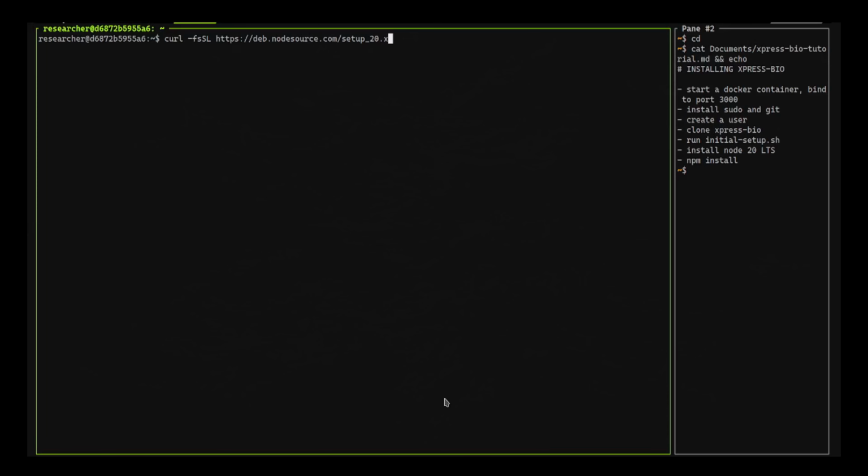Okay, now we're going to do it like this. Don't do this, okay? Normally, this kind of thing is frowned upon. You usually want to have an idea of what you have downloaded and what you're executing. But in this case, for demonstration purposes, I'm just going to execute it.